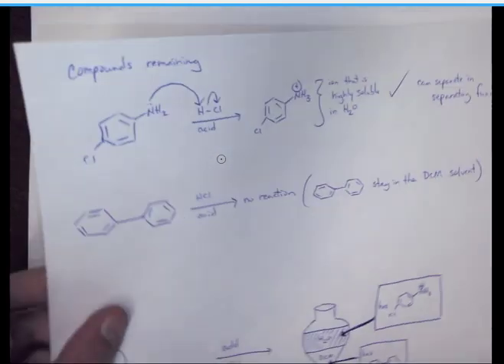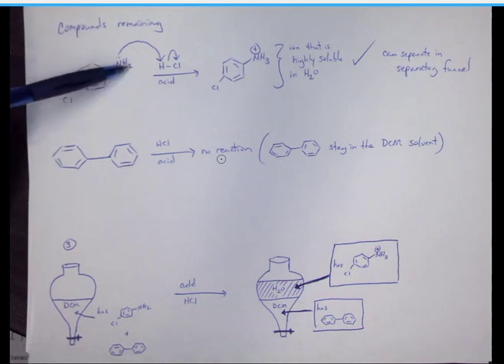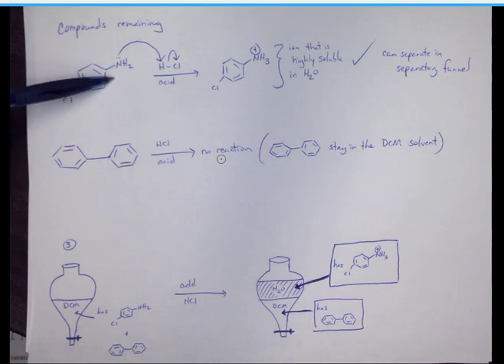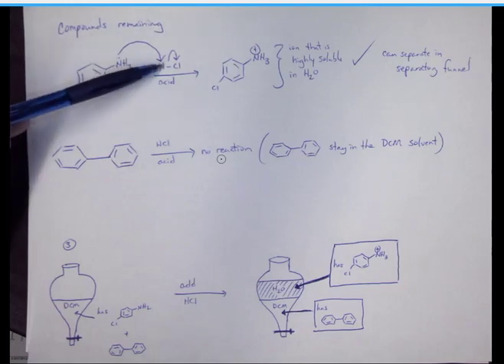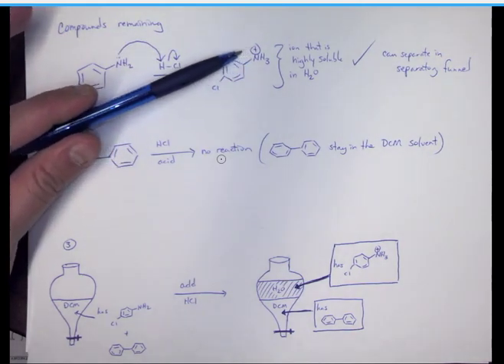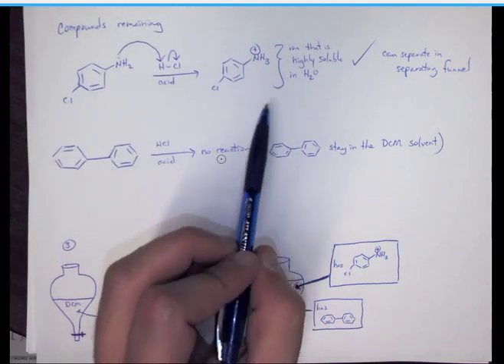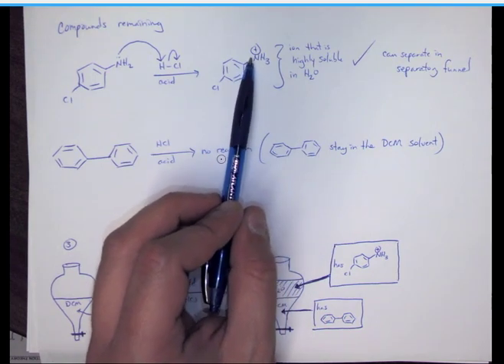Okay, now after that, like I said, once you've done that, you still have two compounds remaining. You have your amine compound and your neutral compound. So now, since amines are basic, you can add a strong acid like HCl and do another acid-base reaction. You can see here the lone pair on the nitrogen is attacking the hydrogen of HCl, so it's going to protonate the nitrogen. As we see here, we have NH3+.